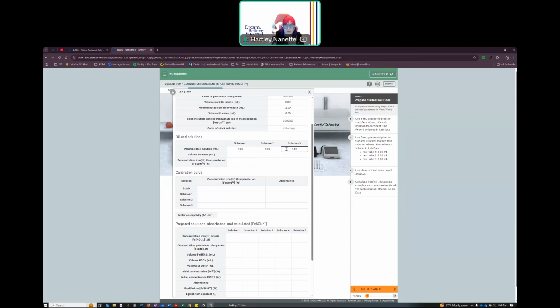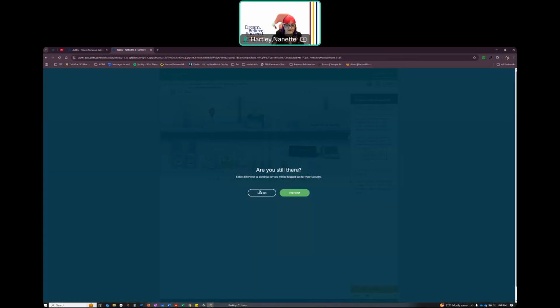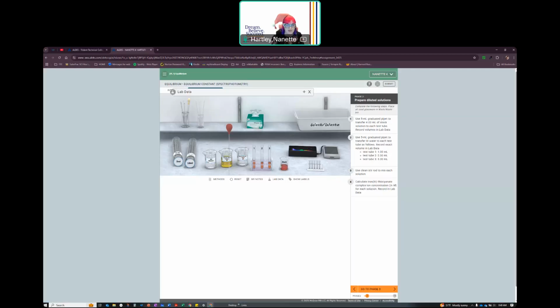I've recorded my volumes. Now I'm going to transfer some DI water. Hopefully it'll let me record this. I can minimize that. So I'm going to take this, I'm going to put it in the DI water. I'm going to do 1 in test tube 1. So that goes in here. Now I'm going to take up 2 and put that in test tube 2. And then I'm going to do 3 in test tube 3.